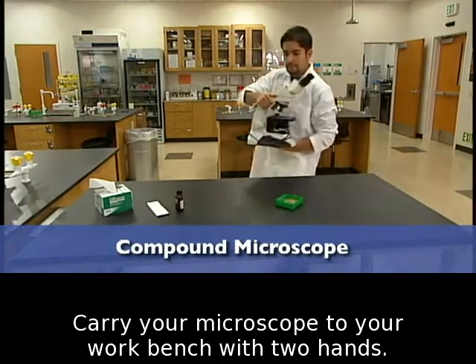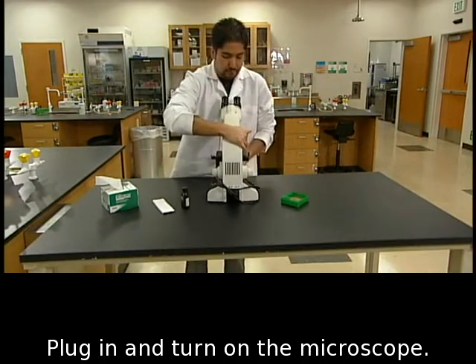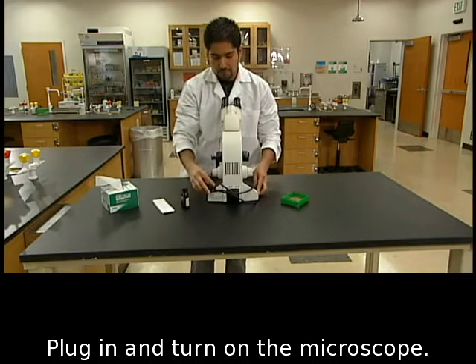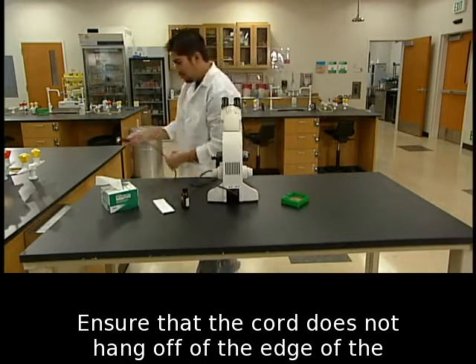Carry your microscope to your workbench with two hands. Place the microscope on the bench squarely in front of you. Plug in and turn on the microscope. Ensure that the cord does not hang off of the edge of the bench.